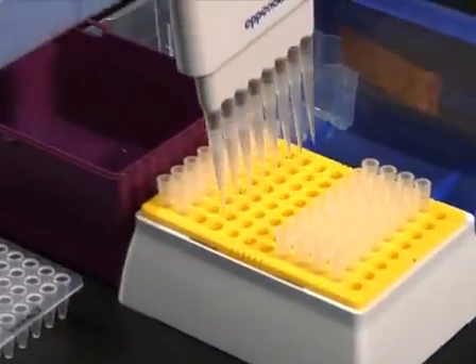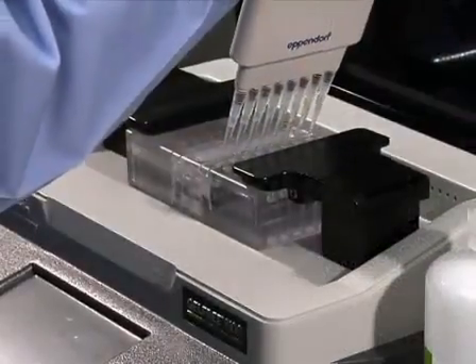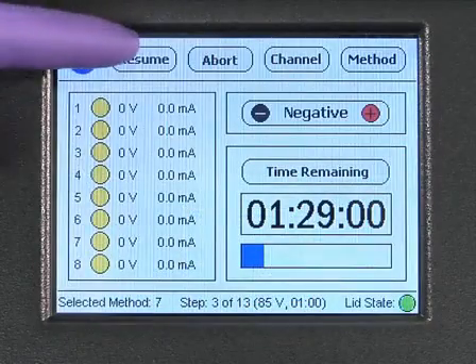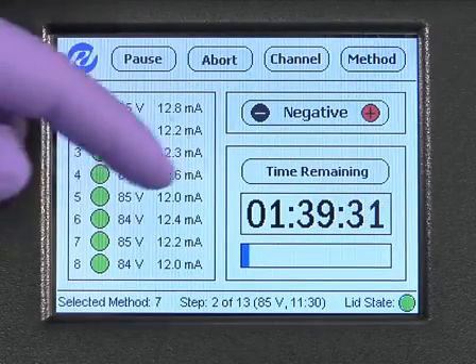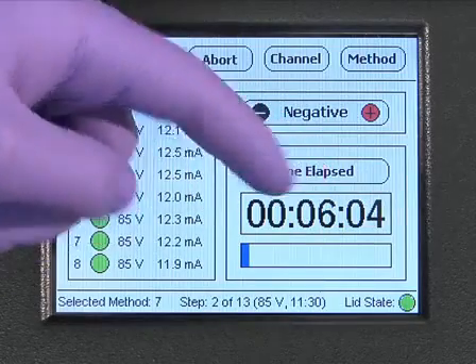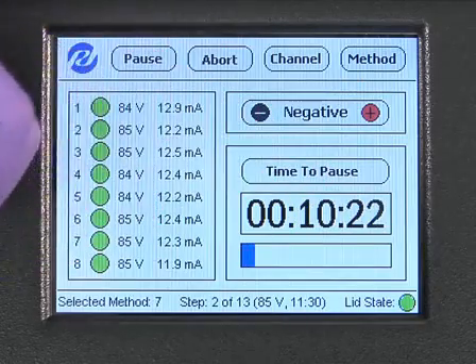After washing, add 100 microliters of GelFree running buffer back into the collection chambers, close the lid, and press the resume button. The GelFree 8100 will run until the next time interval. The total time remaining in the experiment is shown on the right-hand side of the screen. Press the button above the box displaying time to toggle between time remaining, time elapsed, and time to pause.